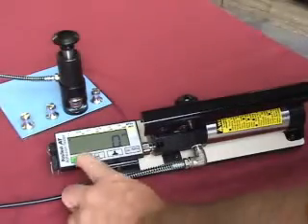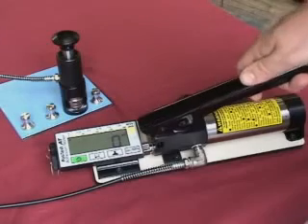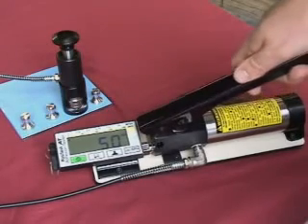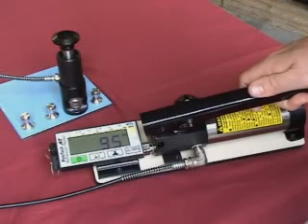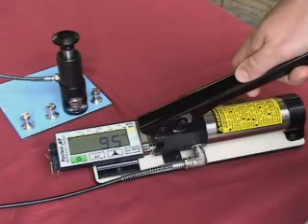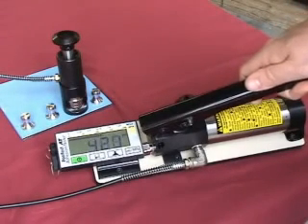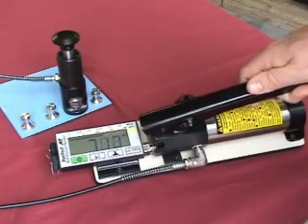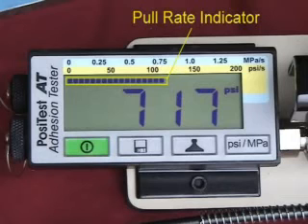Press the start button to initialize the tester for a pull. Prime the pump. The large, easy-to-read LCD display will continuously indicate the pressure in the system. For optimum results, it is recommended to reach the pull-off target pressure in the middle of a stroke. Unless stated differently in the test specification, continue pumping at a maximum rate of 1 MPa, 150 PSI, per second until the actuator pulls the dolly from the coating. The graphical pull rate indicator enables the operator to monitor and adjust the rate of pull.